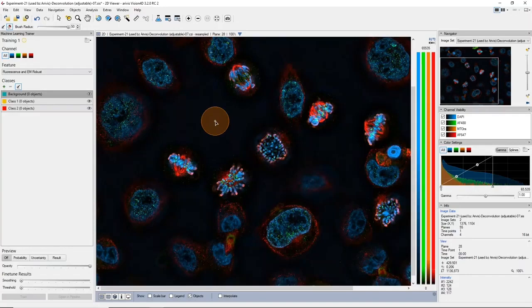So in this case, we're doing essentially the same thing, which is we teach the software what we think is an object, and then the software makes a decision based on what's called a random forest pixel classification. So it's still essentially a pixel classification algorithm, and it's not going to recognize cats. Unfortunately, that's more related to deep learning and pattern recognition.